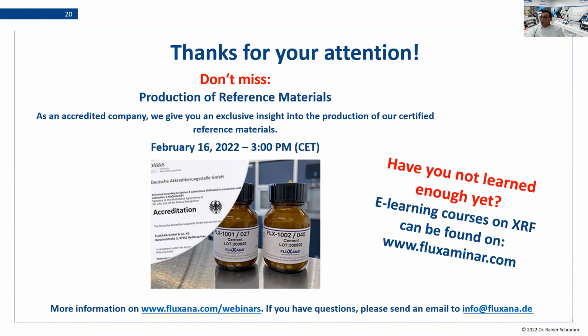Let me see, for creating a calibration method, how many samples and what kind of standard samples have to be used? So first of all, the standard samples have to be matched to your samples. Yeah? So you need a matrix match. The second is the number of samples. I would say if I make a calibration curve, I would like to have at least about 5 points.